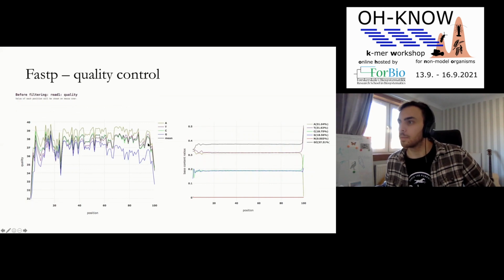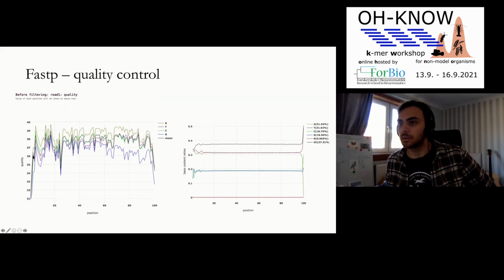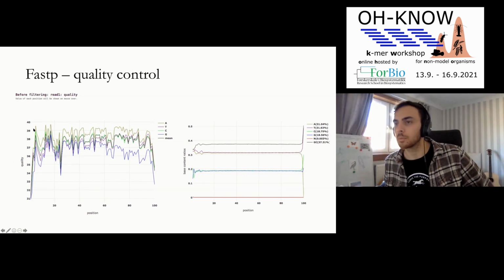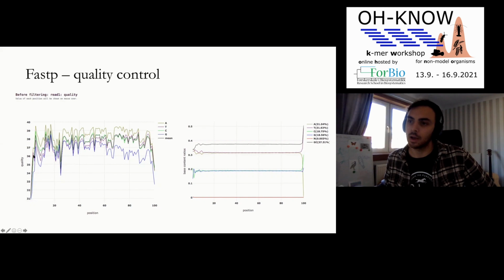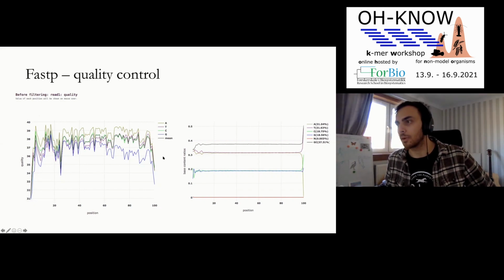And then it will give you some nice graphs like this. It will tell you, is there a particular place along each read where the quality dips? Somebody might have bumped the machine, or there might have been a problem with some of your reagents if they weren't put into the flow cell correctly. Here you can see there's this big dip around, I don't know, 23. This is obviously really good to know if you want to do any processing later on, although with something like this, I would leave it. But especially at the ends of the reads, it can help you know if you need to trim off the ends, for example.